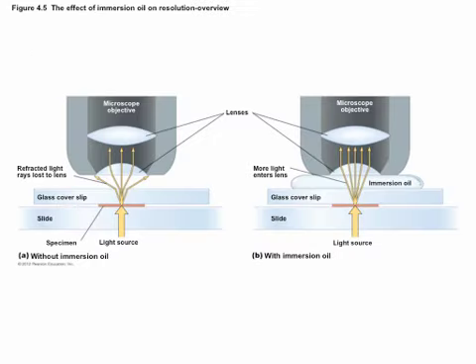Just to show you how oil is going to actually help, who here has ever played with a prism before? You all know. When light passes from one medium, like the air, into another, it gets bent, and different colors of light get bent to different degrees. This is what causes the rainbow effect. Well, glass is one medium that it can go through, and then air is another. And then it's got glass again with the lens. All of this bending back and forth.